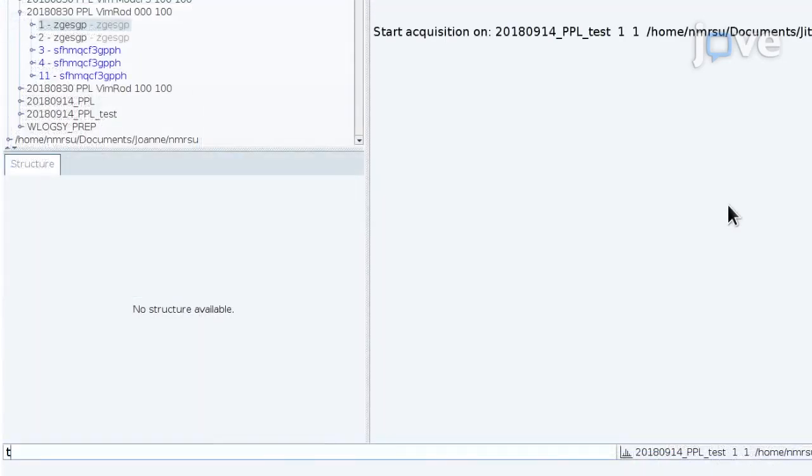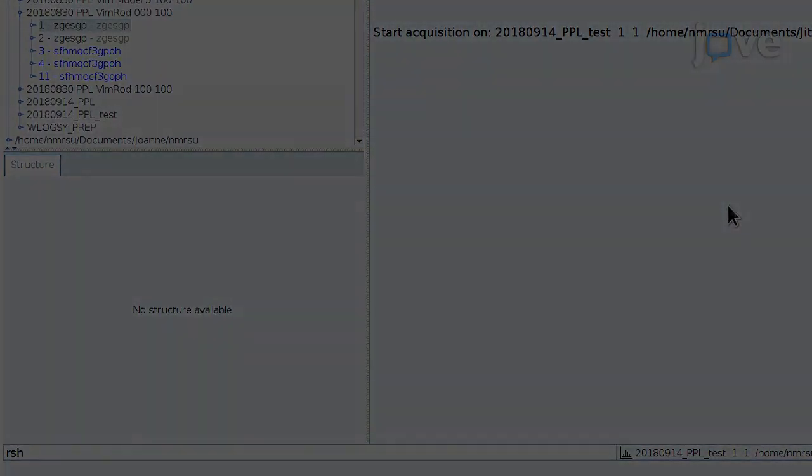Shim the magnetic field using top shim. Shimming makes adjustment to the magnetic field to achieve uniformity around the sample. It is good practice to store the shim values with the command WSH and read them using RSH before top shim, if using the same or similar samples.